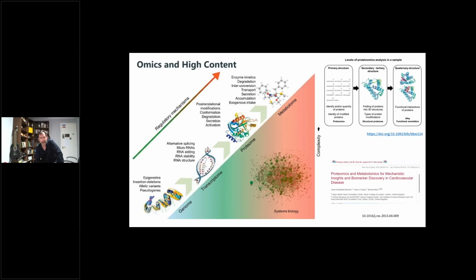And coming up to my last slides now. So we use all of this biological information, so genomics, transcriptomics, proteomics, metabolomics, to really understand what happens when we add a chemical to a cell, what's it doing? And the integration of these techniques is really helpful. We can't do it all the time, but every time we do an exercise, we learn a lot. And one of the most useful ones at the moment, because of the technology, is transcriptomics. Because transcriptomics tells you the intention of the cell. And the intention of the cell is what we're after. Because if you add a chemical and the cell intends to do a DNA stress response, it means it sensed DNA damage. So that's really useful.